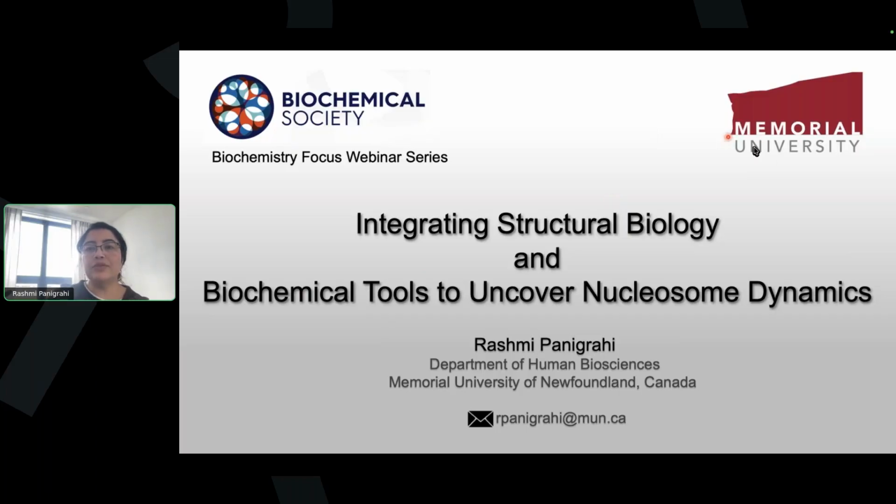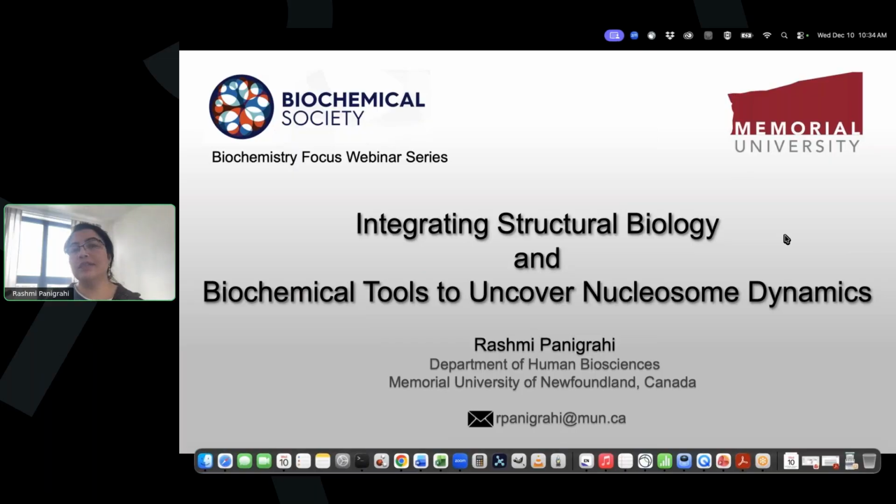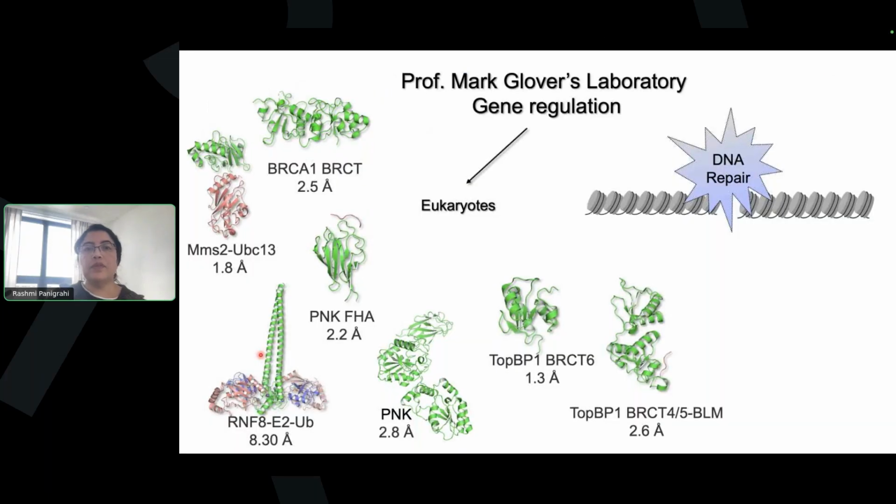Today I'm going to talk about a project that I did in my postdoc in Professor Mark Glover's lab, where we integrated structural biology and biochemical tools to uncover nucleosome dynamics. Professor Mark Glover's laboratory has been focusing on gene regulation, both from prokaryotes and eukaryotes. Crystallography is the primary technique in our lab, and these are some of the high resolution, beautiful structures, particularly from the eukaryotic arm.